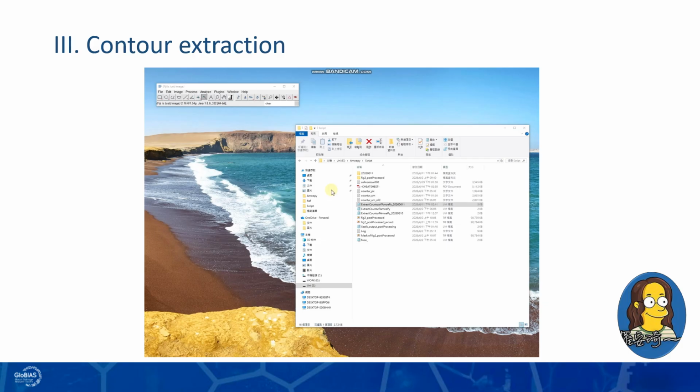After obtaining clean masks, the next step is contour extraction. This video demonstrates how to use the provided Fiji macro to extract coordinates from each cell mask. The extracted coordinates record the position of coordinate markers at every time point, and serve as the direct input for subsequent analysis in AmoePy. Hi, this video demonstrates how to extract contour coordinates from a binary image stack for AmoePy using our Fiji macro.